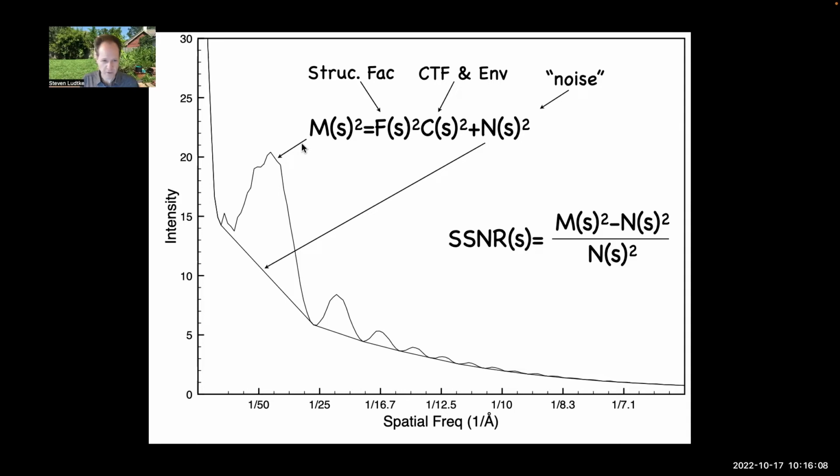And that's why in the previous curve, we didn't see perfect agreement between the theoretical CTF and what we were seeing in the image. The periodicity was the same, but the amplitudes weren't, because what we're seeing is the structure factor multiplied by the CTF. What I was plotting in blue was just the CTF. We were omitting the actual specimen itself. Now, once we've split the data up this way, we can compute an additional derived value, which is known as the spectral signal to noise ratio.